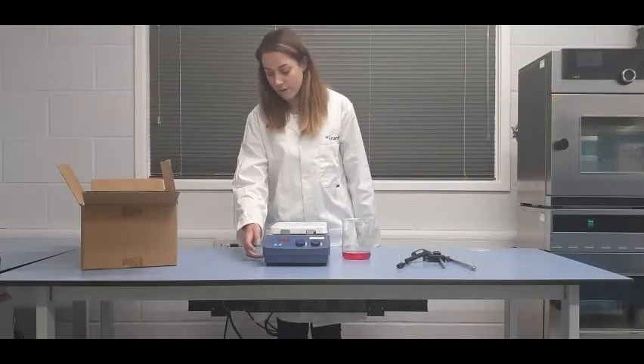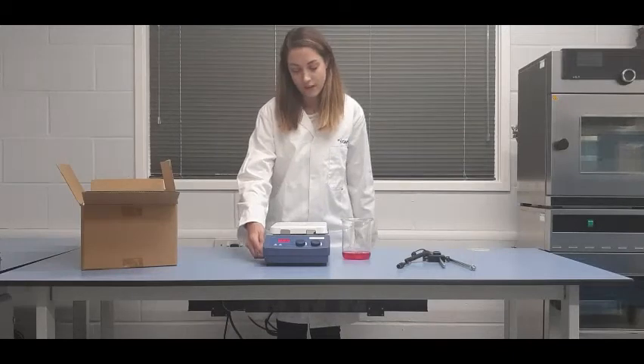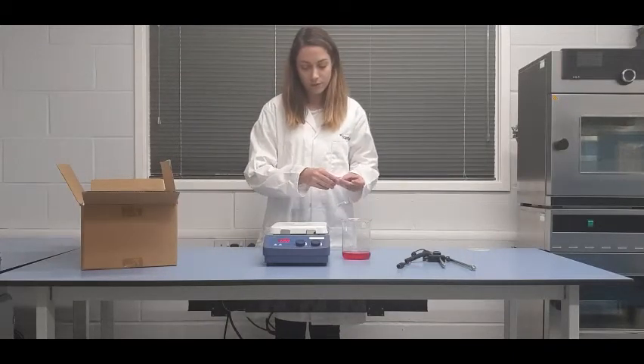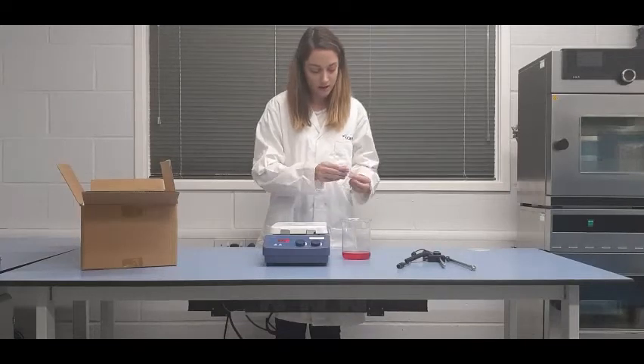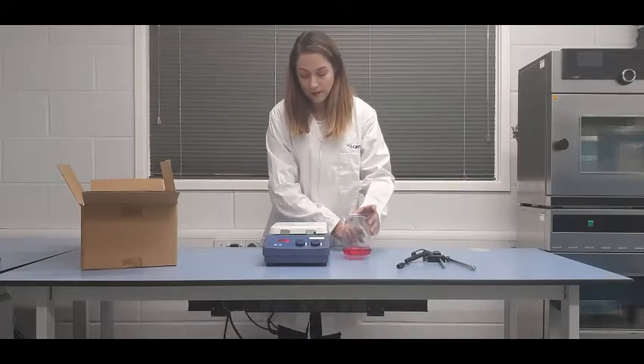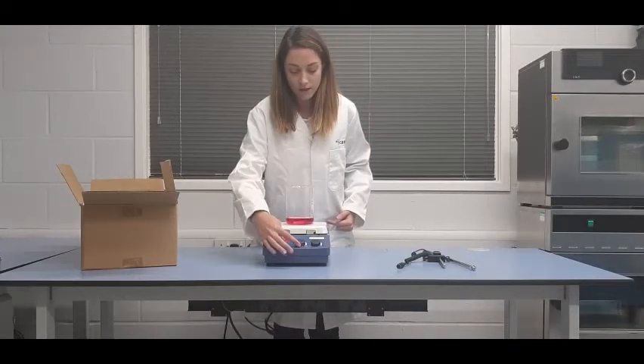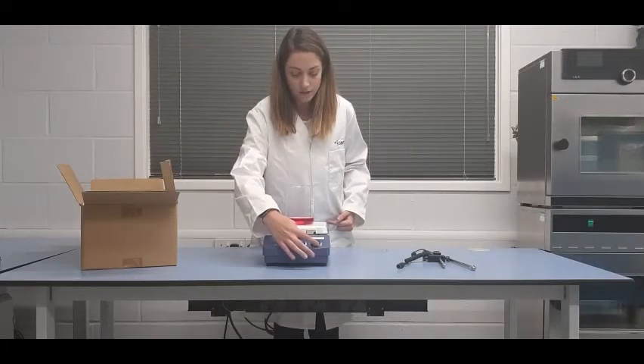To use the hot plate stirrer, flip the switch located on the front left on the side. If you're planning on stirring the sample, don't forget to add a magnetic stir bar. Place the beaker onto the hot plate and you can control the heat and the speed with the dial on the front.